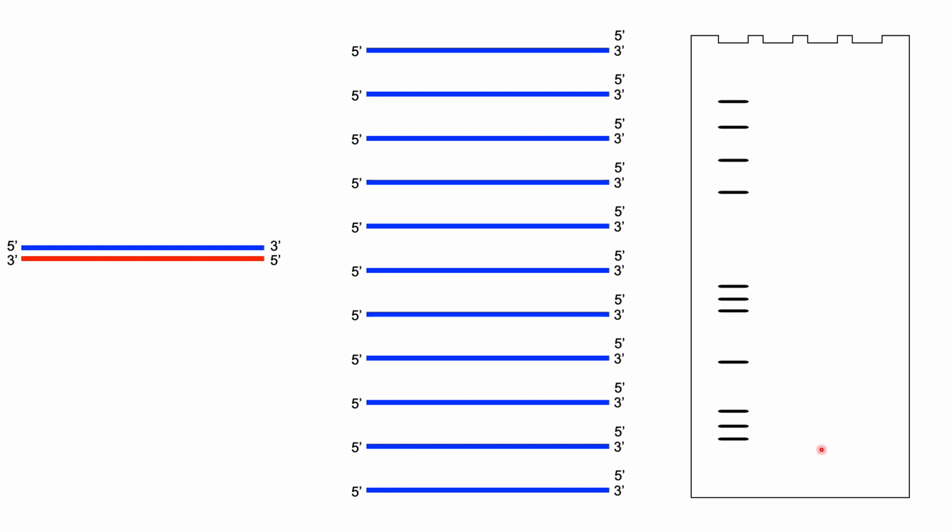You would have to run all 4 and then build backwards, start from the bottom and essentially assign nucleobases all the way up to the top, building it from the 5' end of your primer all the way to the 3' end extension.